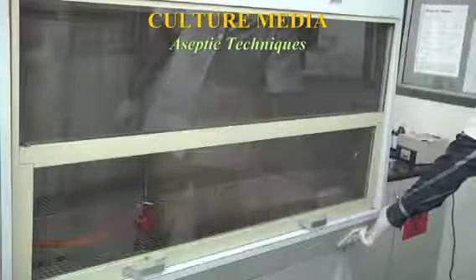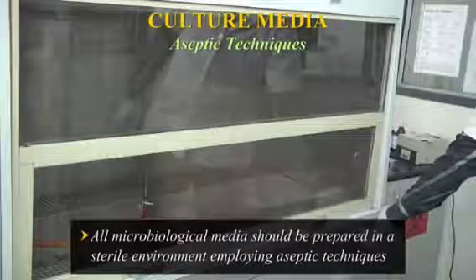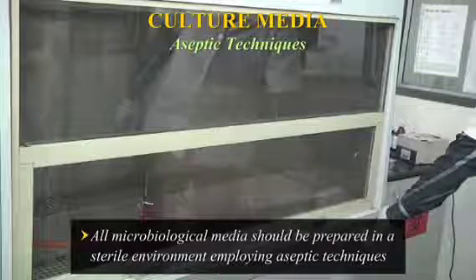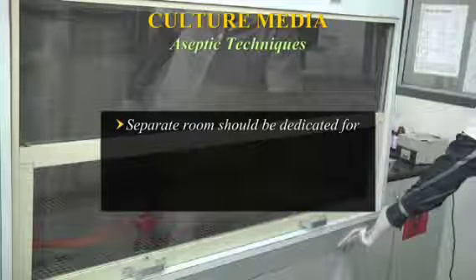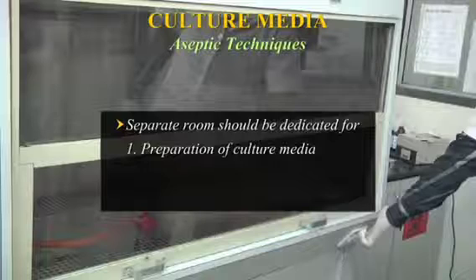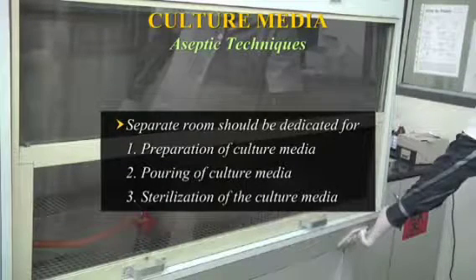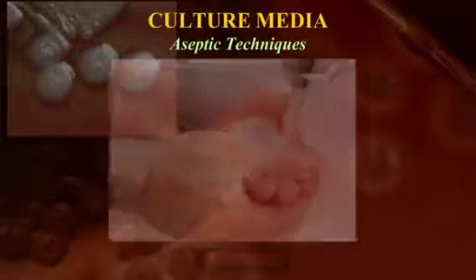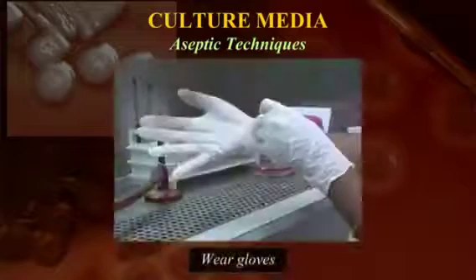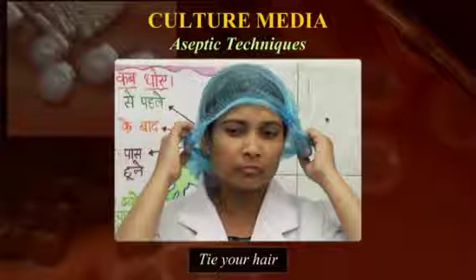Aseptic techniques. All microbiological media should be prepared in a sterile environment employing aseptic techniques. A separate room should be dedicated for the preparation, pouring, and sterilization of the culture media. Disinfect the work area. Wash hands, wear gloves, lab coat, and tie your hair.